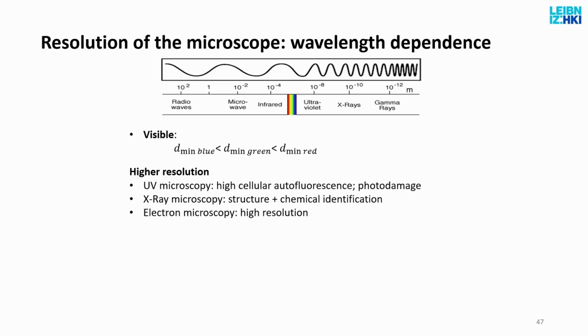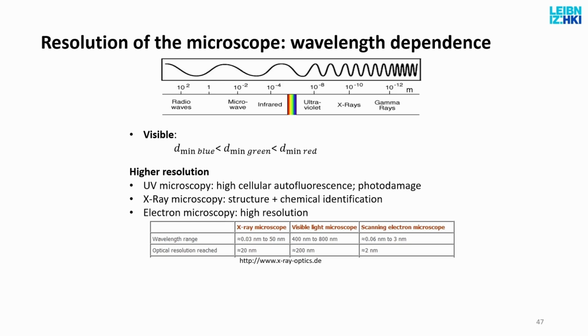Now we are talking about the nanometer range, so 100 times better than fluorescence microscopy. Special preparations are required. It is slow. The field of view is much smaller, so it has disadvantages as well as advantages. The modern technique is combining fluorescence microscopy with electron microscopy. So you see both a low resolution but well characterized fluorescence image plus the corresponding electron microscopy image. These are the wavelength ranges, so X-ray gives a 10-fold increase, scanning electron microscopy a 100-fold increase in resolution.